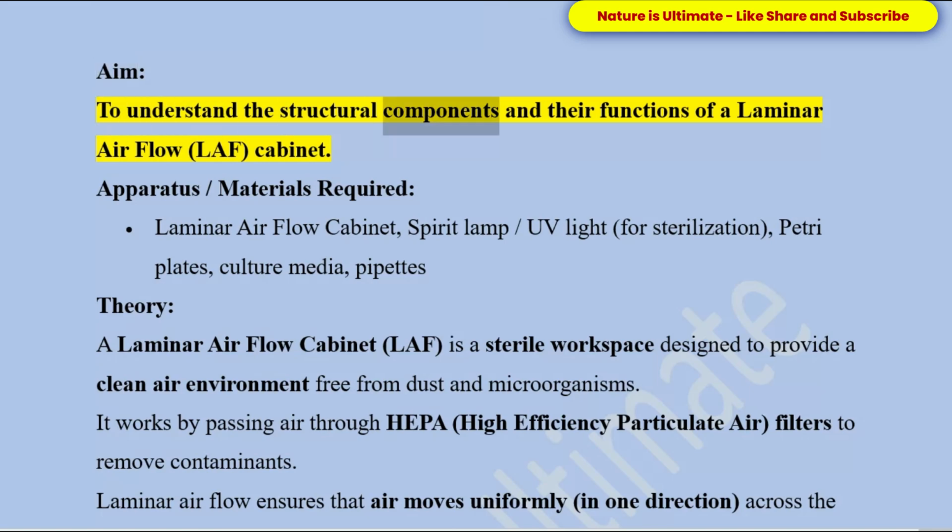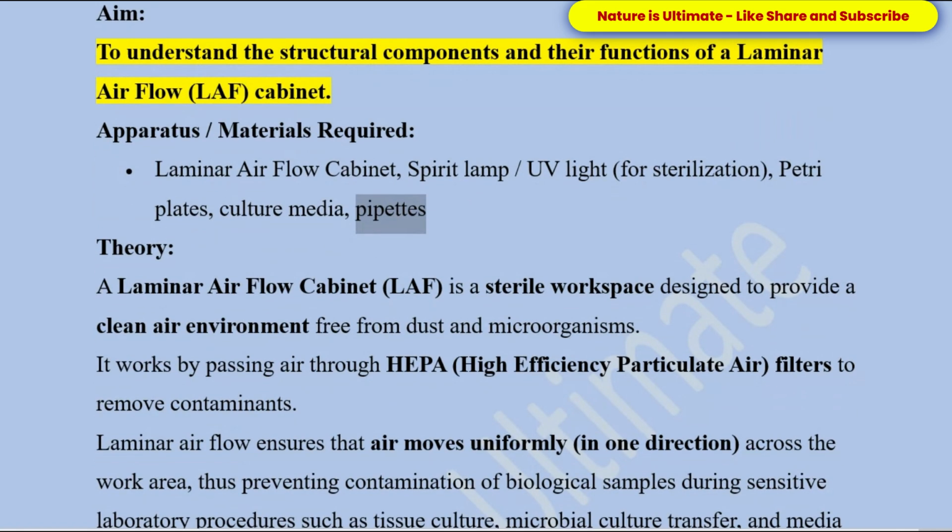To understand the structural components and their functions of a laminar airflow cabinet. Apparatus/materials required: laminar airflow cabinet, spirit lamp/UV light for sterilization, petri plates, culture media, pipettes.